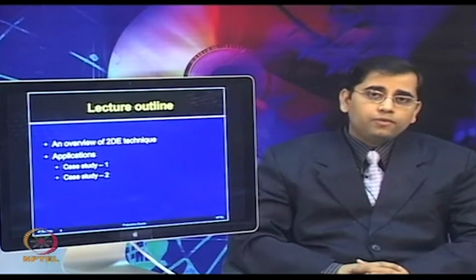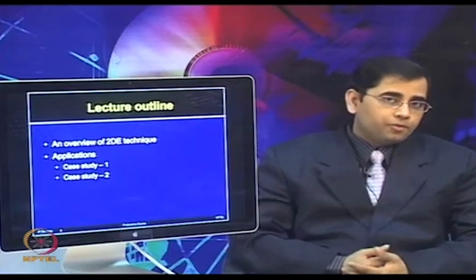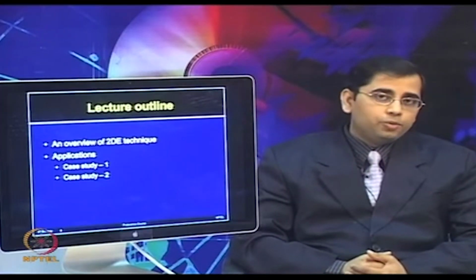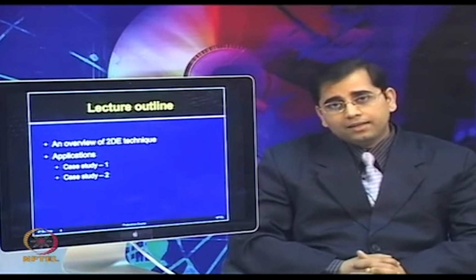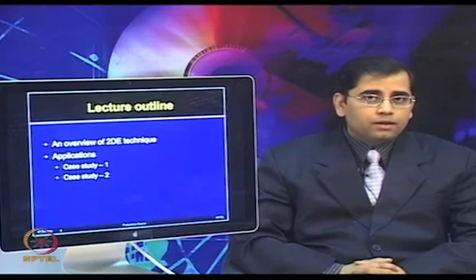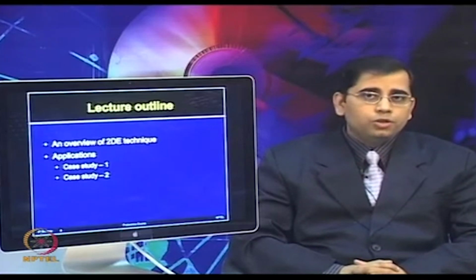Now, if you are interested in investigating all the proteins of a given sample, that will be considered global proteome profiling. Many times if the proteome of a given species is not known, then proteomic techniques are used for global proteome profiling, but most commonly they have been used for differential proteomics. So, today we will discuss two papers where authors have applied differential proteomic analysis by using two-dimensional electrophoresis.